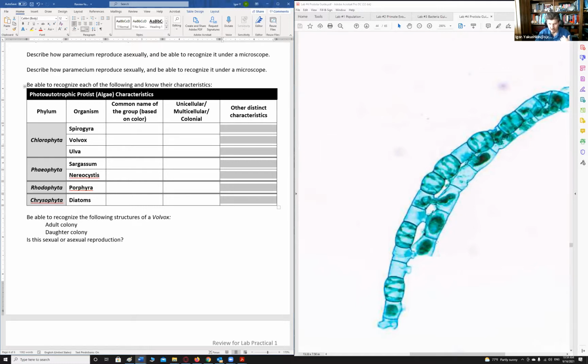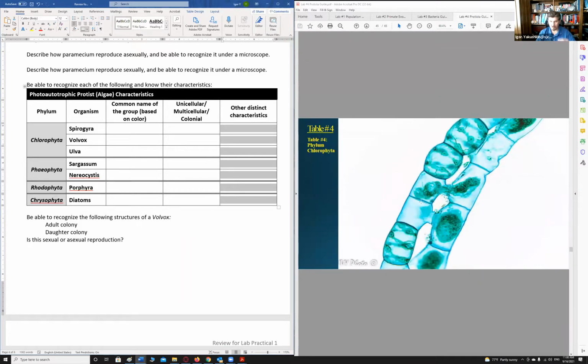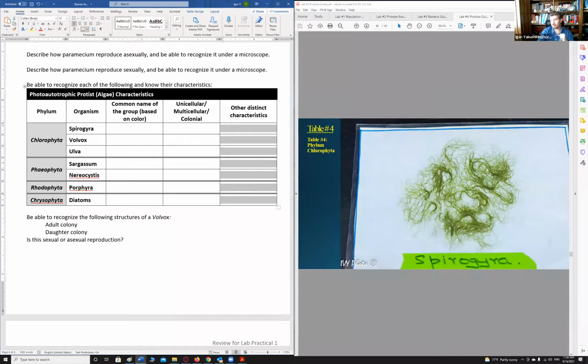So wherever you see the darker spot, the zygote, the combination of the DNA from male and female, that's most likely the female filament. Therefore, that one would be the male, and you can actually see the transfer of genetic material in process. On a static picture it's kind of hard to say which way it goes, but you can clearly see that here we have the zygote. So in this case, left is the male, right is the female, because of the zygote right here. And this is how the dried-up Spirogyra looks, like tiny little threads.